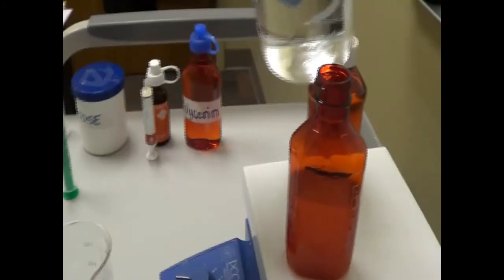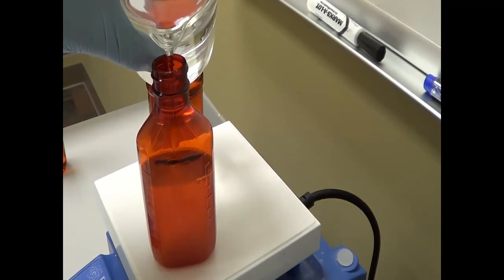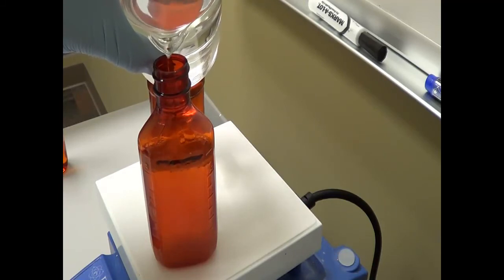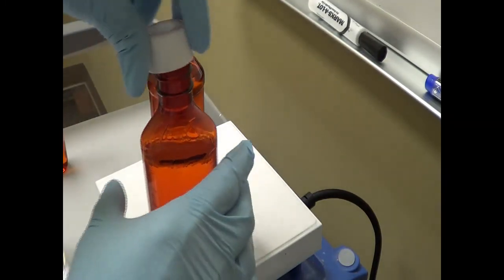I am going to QS to 100 ml now. Whenever you do the QS, you put your bottle on a flat bottom so that you know exactly how much you have to add. We are almost there. Now if you have to dispense it, you have to label it appropriately and dispense it. Thank you.